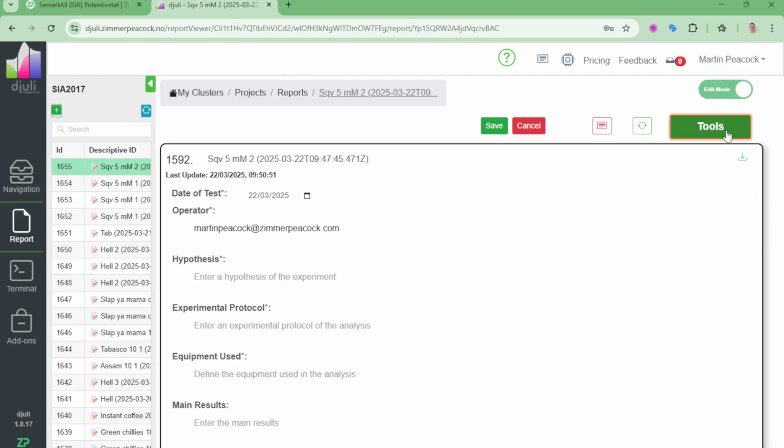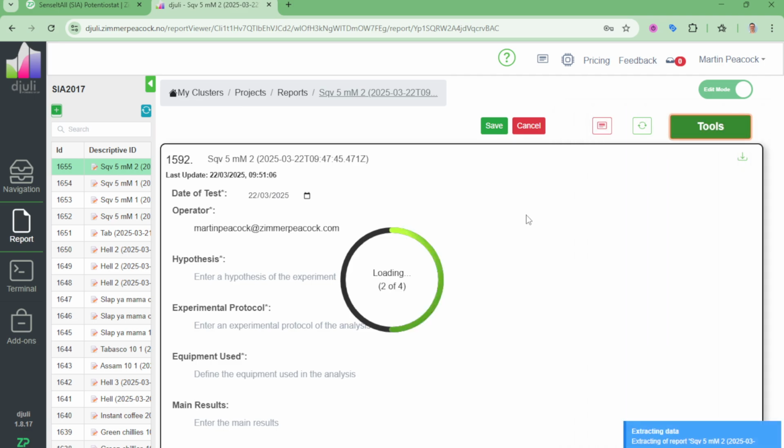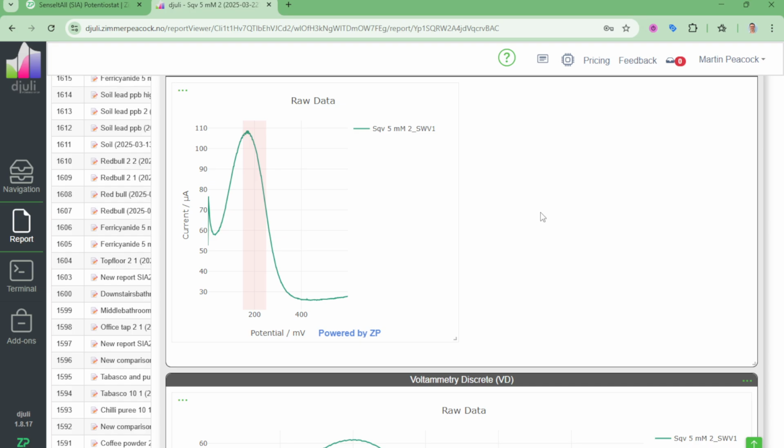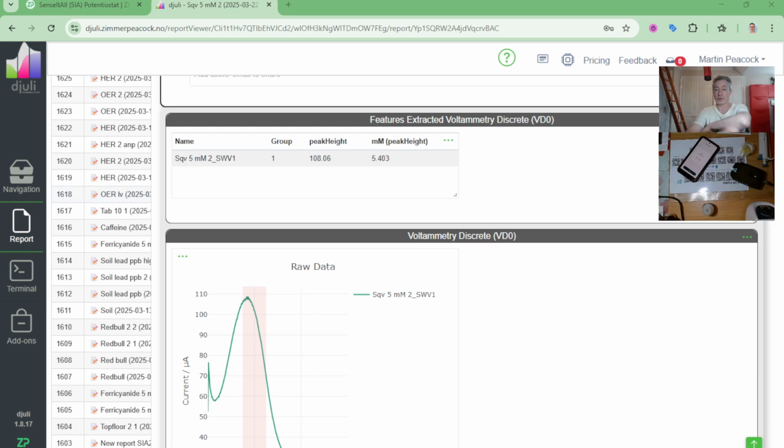So let me just show you how in real time I can actually edit this up, and then I can put 20 in there and have a quick look what that looks like. So at that point now it says about 5.4 millimolar, and the true concentration is actually 5 millimolar, but I can really tune that up and then actually return 5 millimolar. So the last bit there was just really talking about features of Joule.